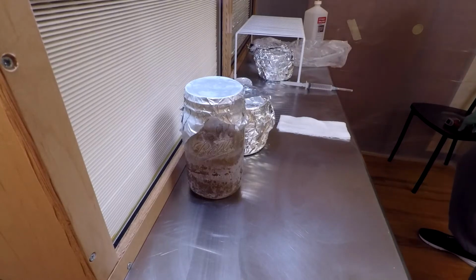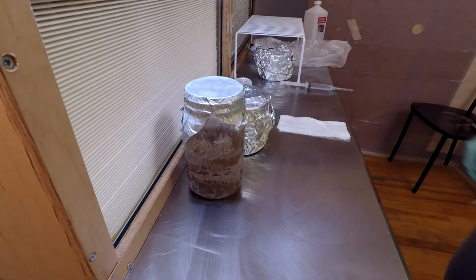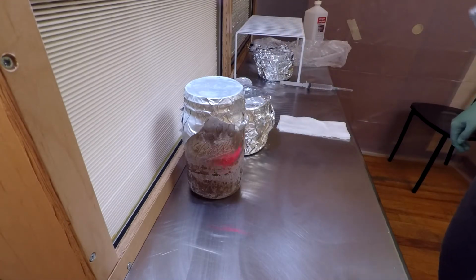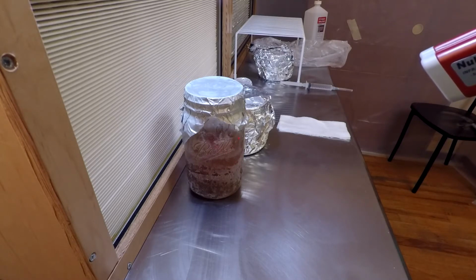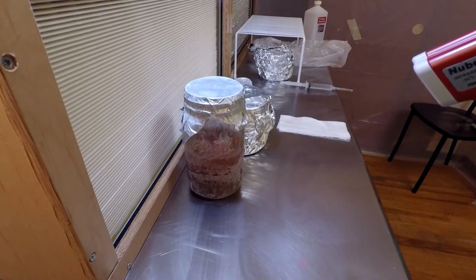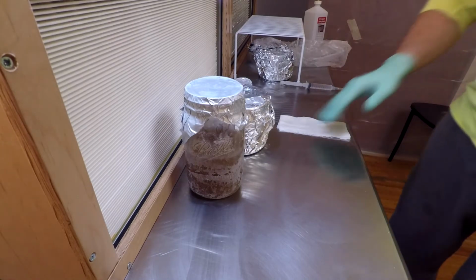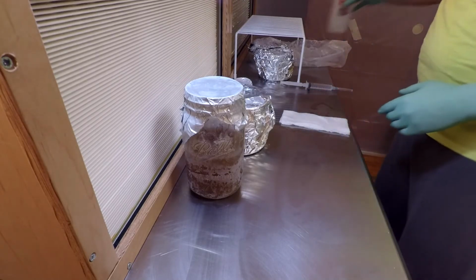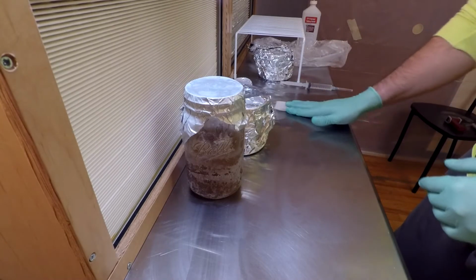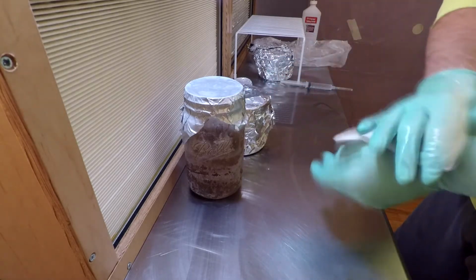Alright, looks like we're ready to go. If I use the same infrared reading tool and aim it at the side of the jar, it gives me a reading of 115 degrees. If I aim it on the inside, hitting the agar, I get a temperature of 105 degrees. I checked online, the actual temperature at which agar gels is anywhere between 90 and 104 degrees Fahrenheit. So I get down to about 105 degrees Fahrenheit. You figure you're probably ready.